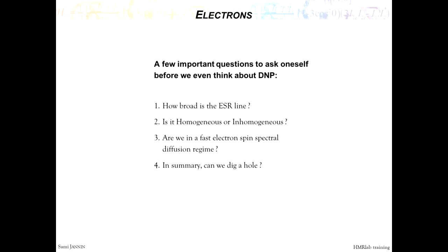And all the indications of the DNP that is observed under MAS do not support the idea that there is a spin temperature. I will show you then a lot of different experiments that show that there is a spin temperature, and under MAS DNP they don't see these effects. So it seems like the situation is very different.